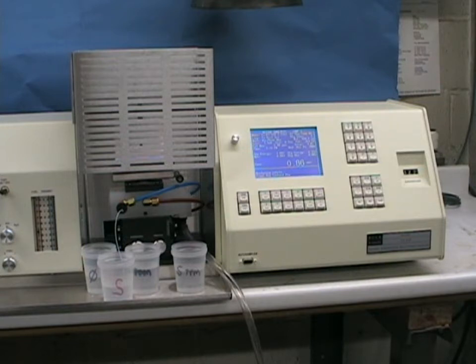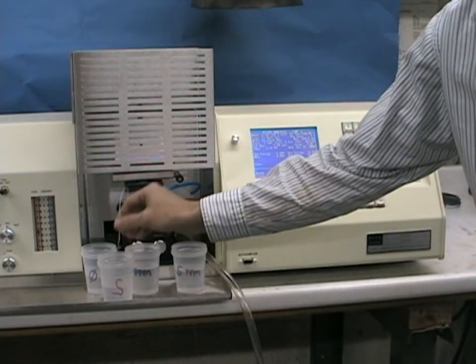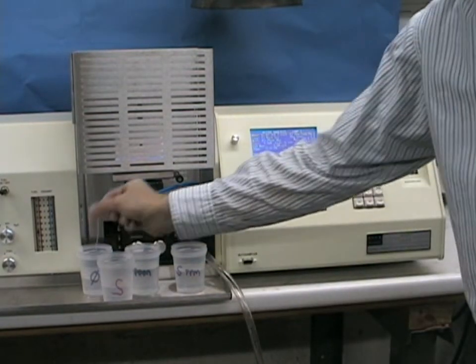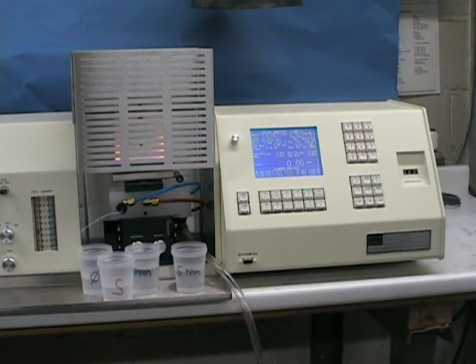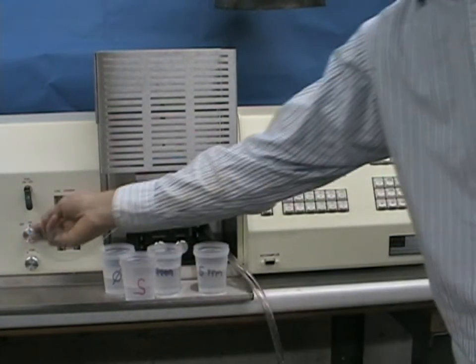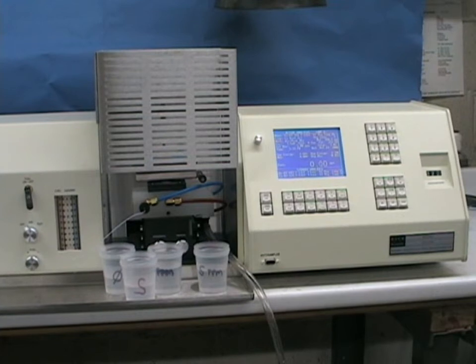It's good laboratory practice at the end of running a sample to take your sample line off the nebulizer and put it in your blank to rinse out any sample, to avoid any buildup of solids. Press the ESC key to check your blank reading, and you can see it drops down to zero very quickly. All solutions should contain at least one or two percent of acid to prevent hydrolysis and keep everything stable. At this point, we can take our sample line out of our water blank, let the nebulizer run dry, shut off our acetylene gas, wait a second or two, then shut off our air, and our analysis is complete.